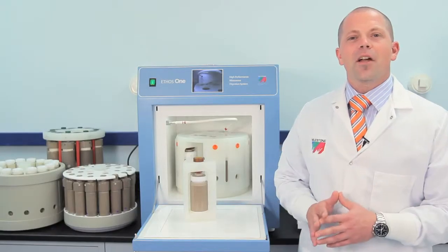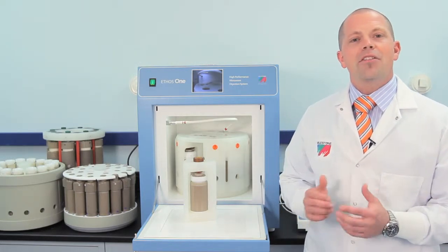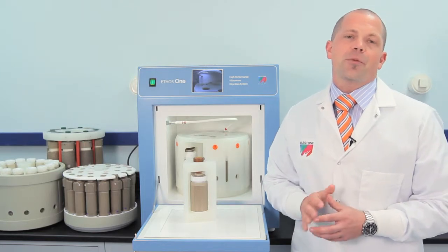The Ethos One comes standard with a thermocouple direct temperature probe which is the most accurate way to monitor temperature and ensure digestion runs are performed safely. Other options such as IR, pressure control, and pressure sensors are also available.